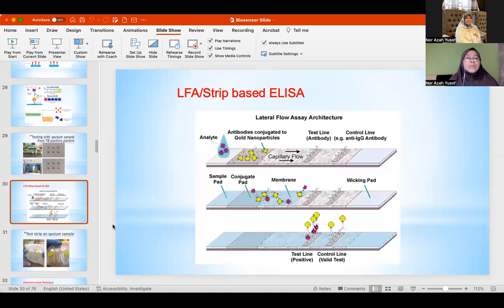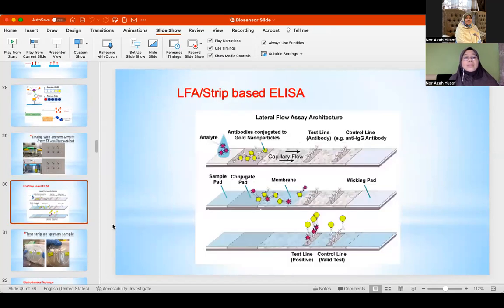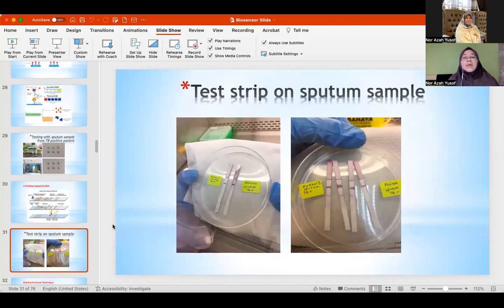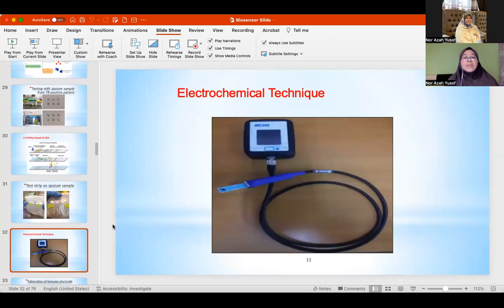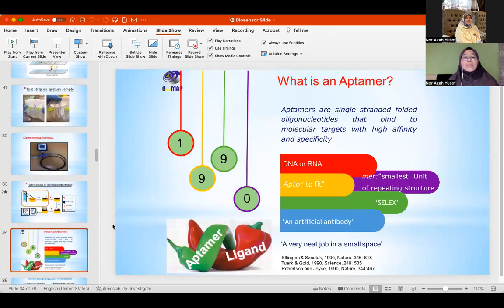Okay, all right. So this is our work on the TB antigen test kit. These are the things that we have done. Similar to COVID-19, it can be used. We also use it with electrochemical techniques, but this one we will discuss when it comes to the transducer discussion. So the third biomarker is the aptamer.